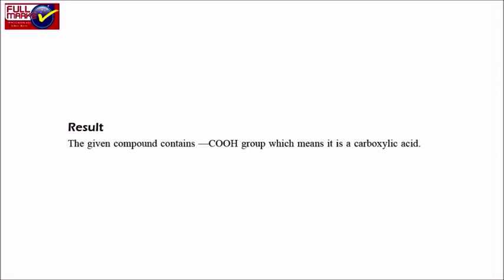Result: the given compound contains COOH group, which means it is a carboxylic acid.